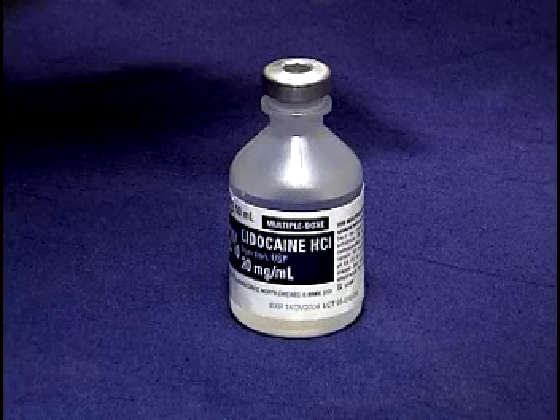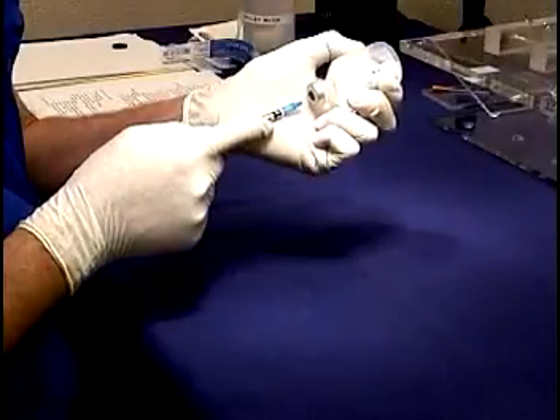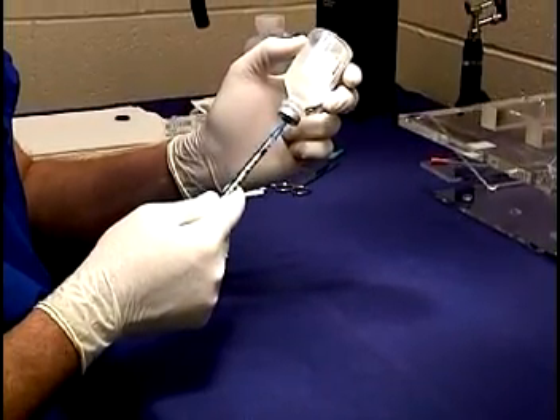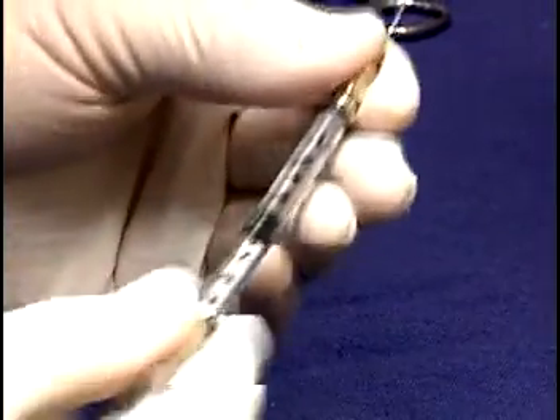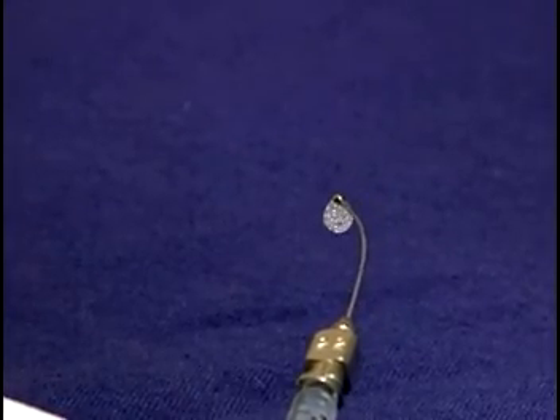2% plain lidocaine is used to provide local anesthesia to the cords. Because Hallowell EMC does not have a pharmacy license, this item will not be in the rat pack when you receive it. However, a space for it is reserved in the box with a label giving the stock number and the 800 number of Webster Veterinary Supply. About 0.3 cc is drawn into a 1 cc syringe. This volume is sufficient to expel the air in the applicator needle and to fill it with lidocaine so that we can deliver one or two controlled drops.